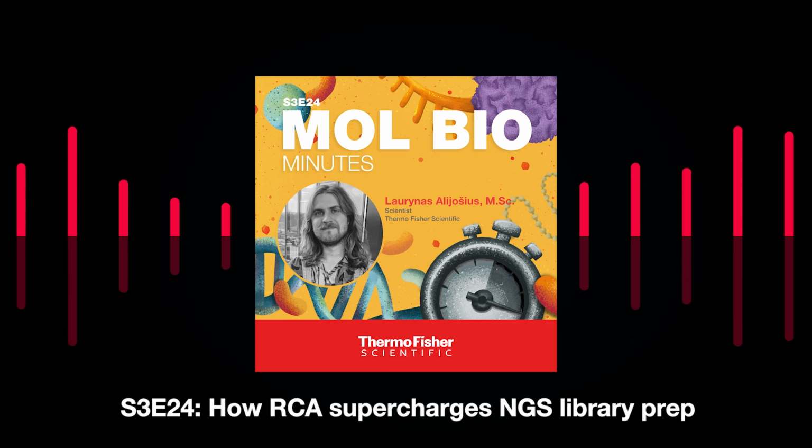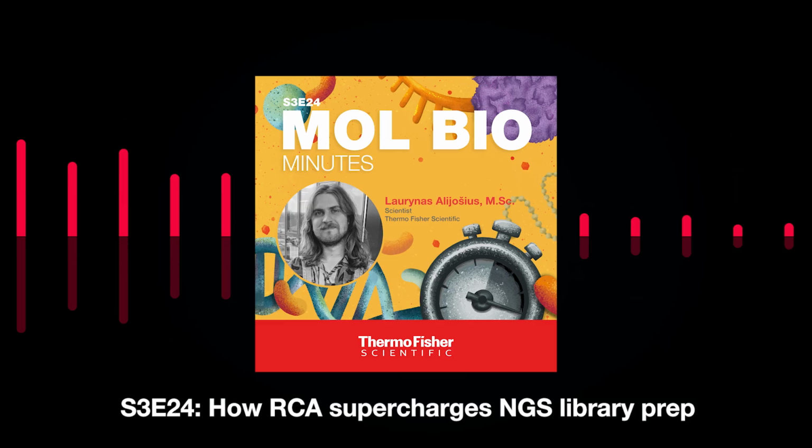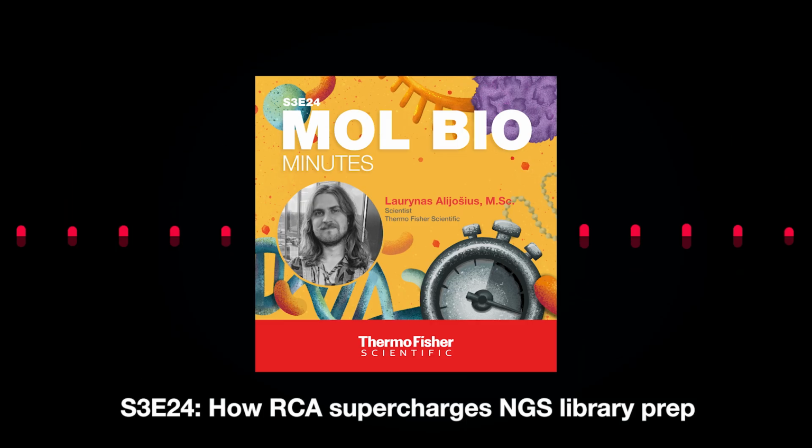To see the whole picture, imagine the RCA method as one piece of the delicious pie made up of different amplification methods. RCA is one type of multiple displacement amplification. Multiple displacement amplification, or shortly MDA, is the general term for a type of isothermal amplification where strand displacement occurs.